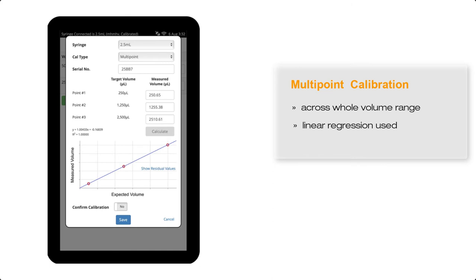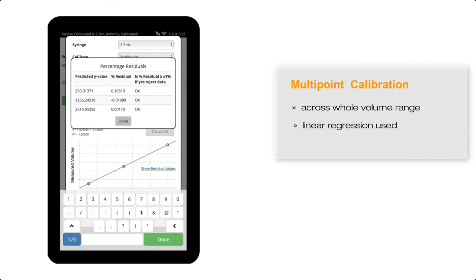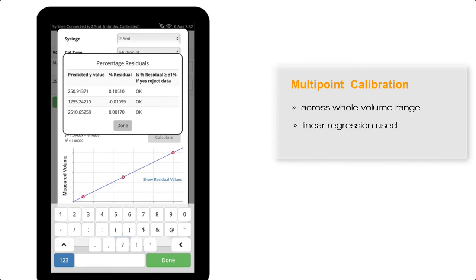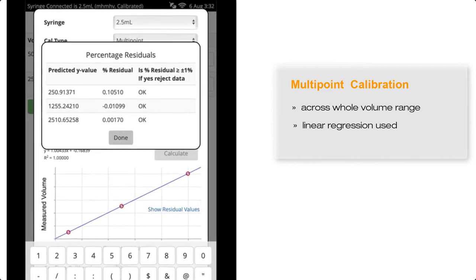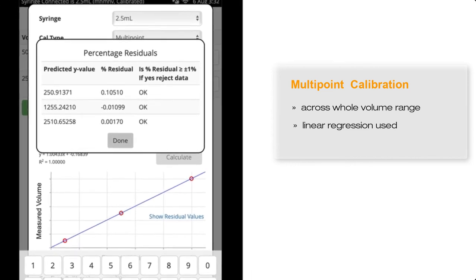To see how close each data point is to the regression line, the residual values are displayed by selecting this. The residuals are displayed as a percentage, and if these values deviate more than 1% from the line, it is recommended that that point be reconsidered through further wanes.